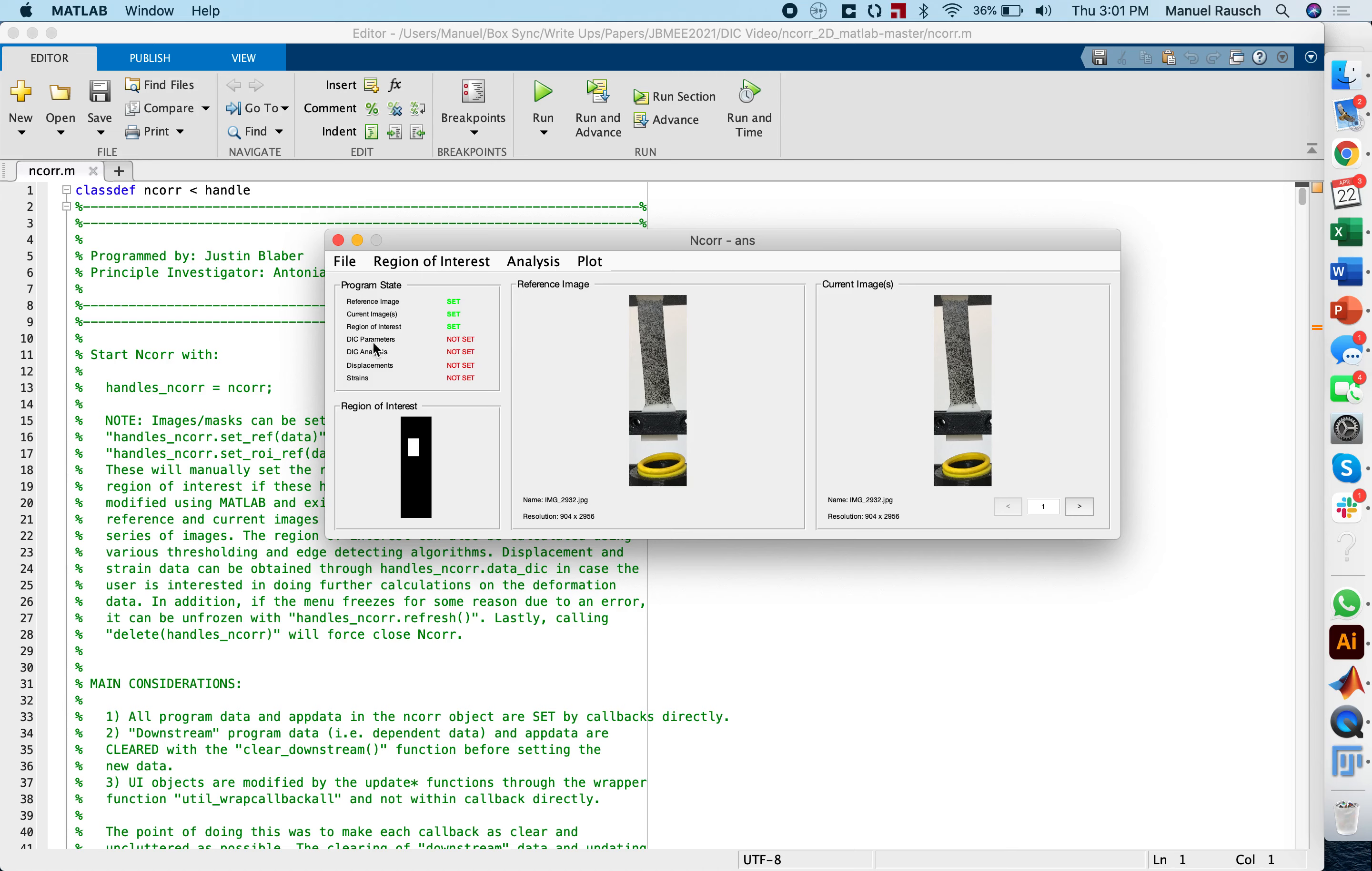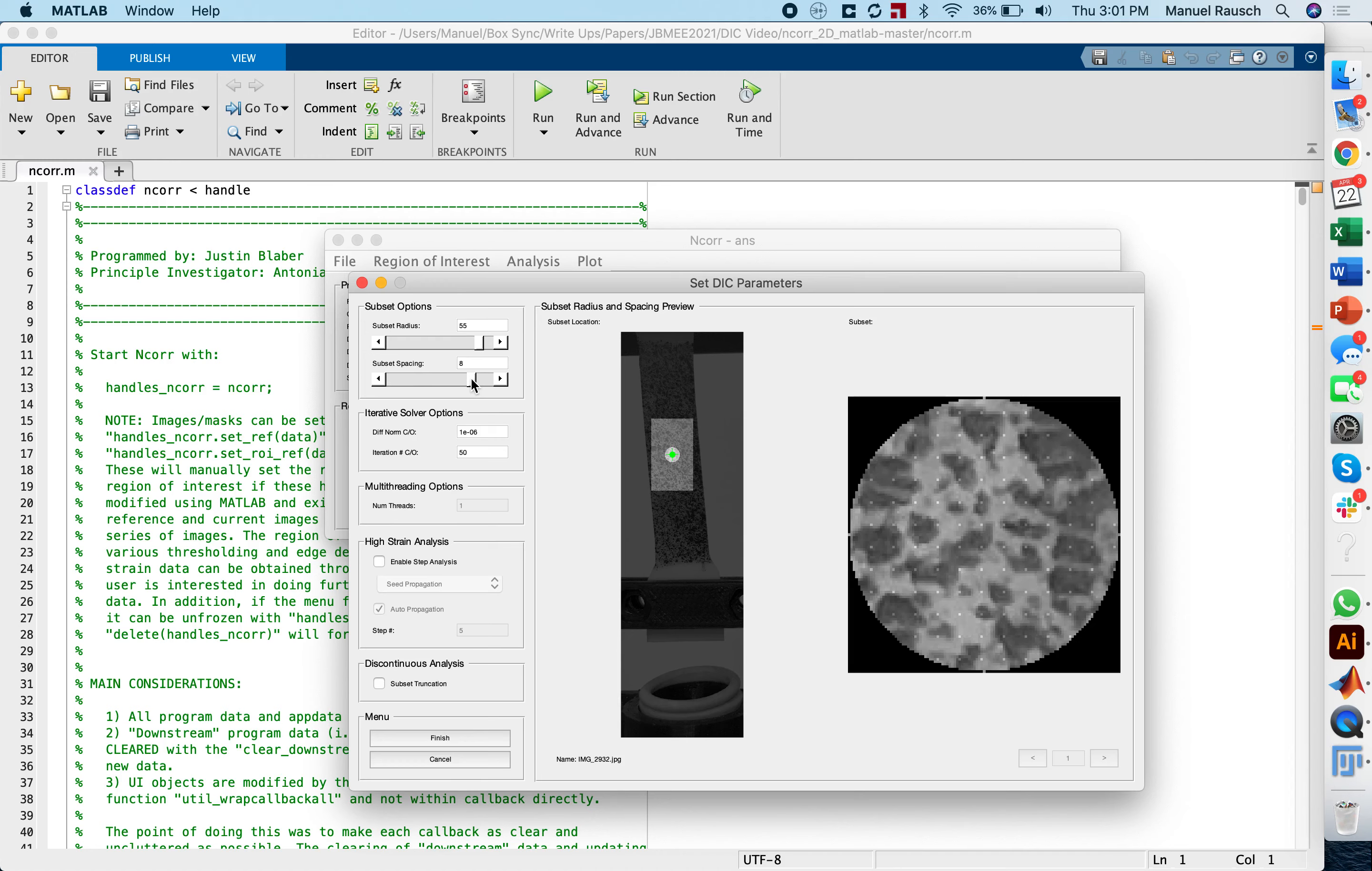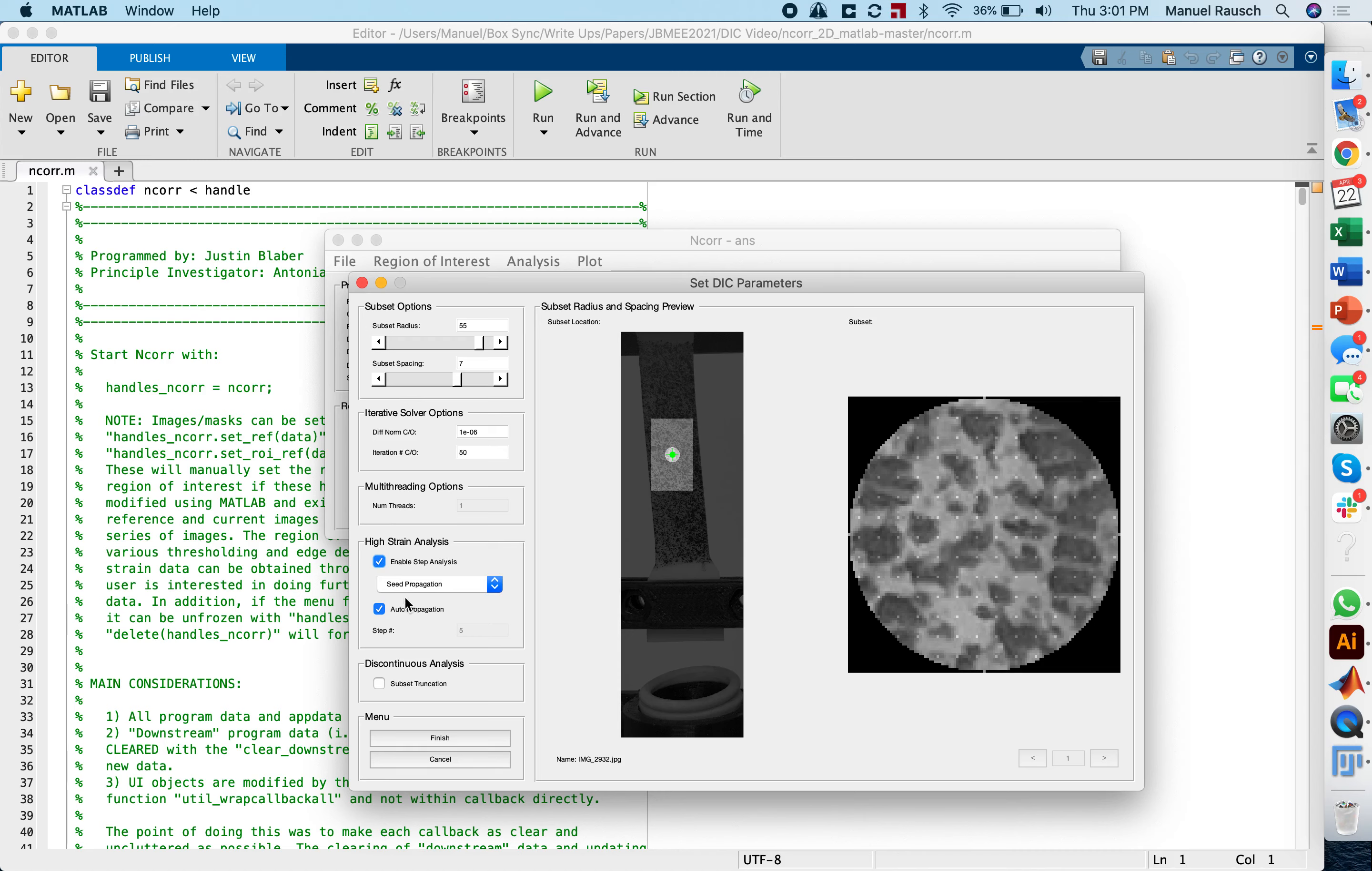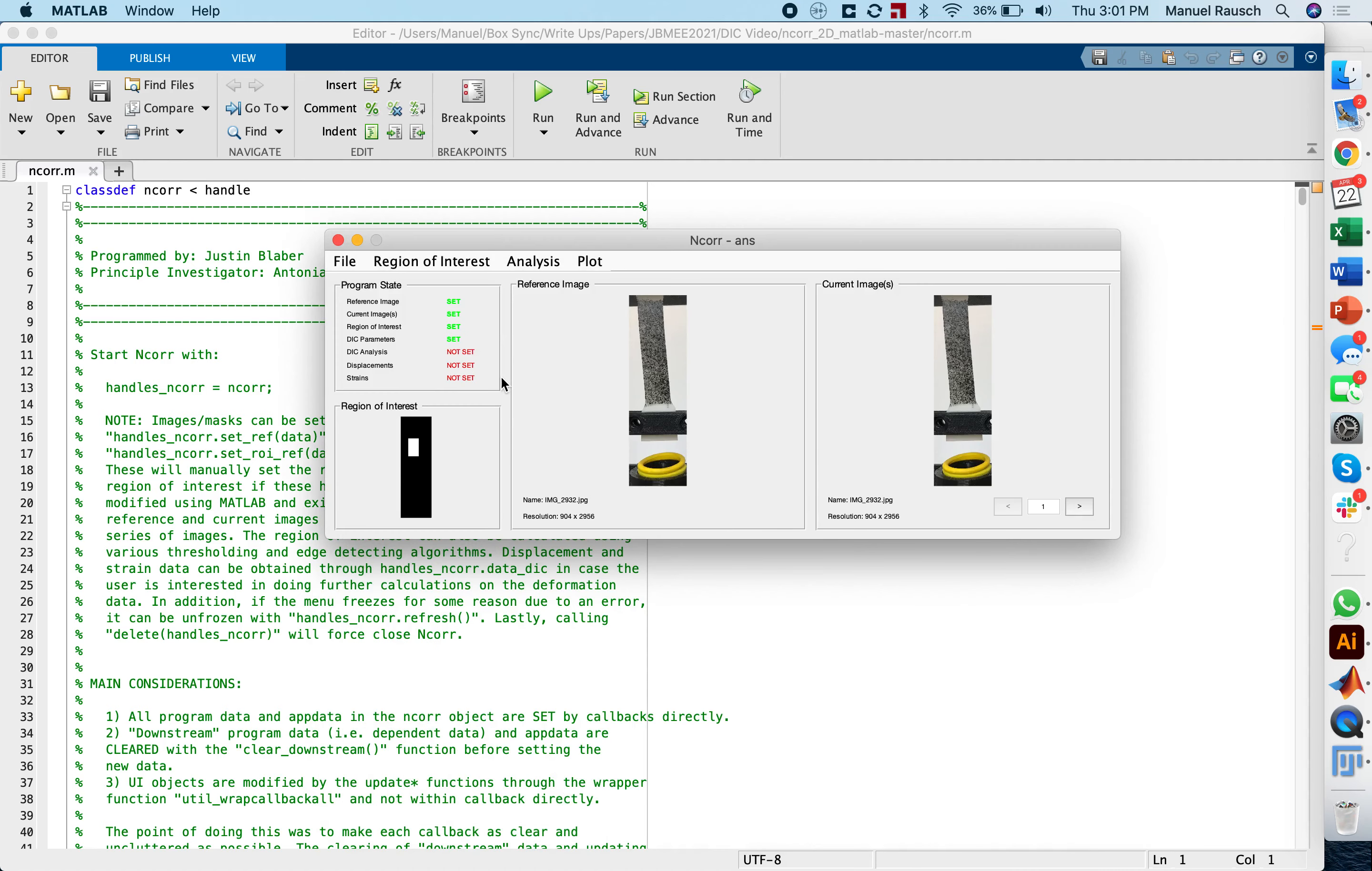And the code tells us the next step is the DIC parameters. So under analysis, we're going to do set DIC parameters. Here you see a resolution or a blowup of our DIC pattern. I've played around with this a little bit and I found that a subset spacing of seven works quite well and the subset radius of 55. If you want to learn more about the specific reasons for why I set them or what they mean, there's a manual available for the software that is quite extensive. I'm not touching these different parameters here, but I will be enabling a step analysis for high strain analysis, and I'm going to use the seed propagation and the auto propagation options. I'm going to click finish and I'm going to confirm these options.